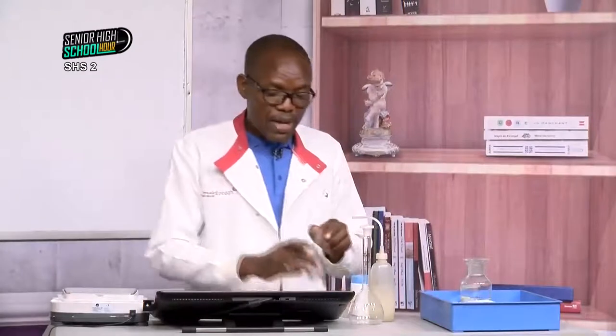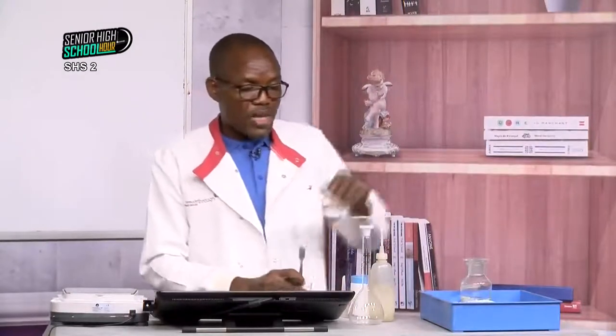You see, straightforward. Okay, what next? Now I have my mass. So this is the mass I'm going to weigh on the balance, dissolve in a little amount of distilled water, transfer to the volume that I need, 250 cm cubed. Top up to the mark. Oh, I'm done. You see, very, very simple. Okay. Now, we have our mass to be weighed.